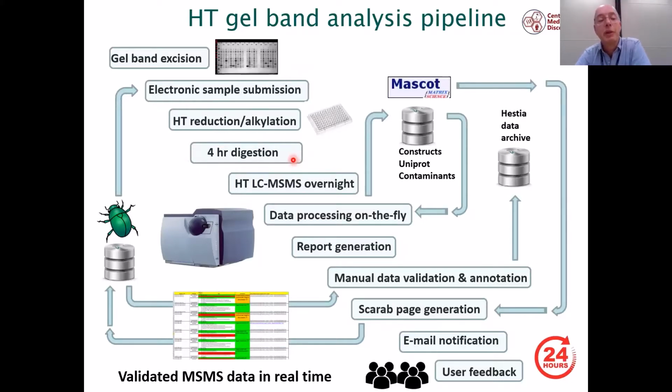That's very useful because it means that if samples are submitted in the morning, in the afternoon they can be digested and then loaded on the mass spec overnight. When it's on the mass spec, we do data processing on the fly. So this database searching is done. So the search for sample 1 is done as sample 2 is being acquired.